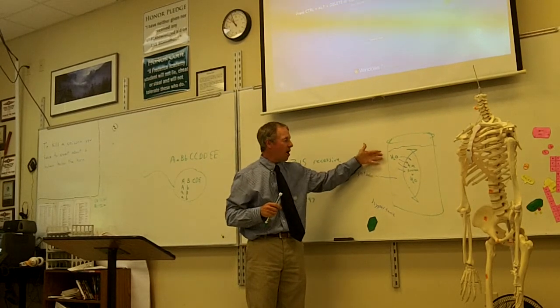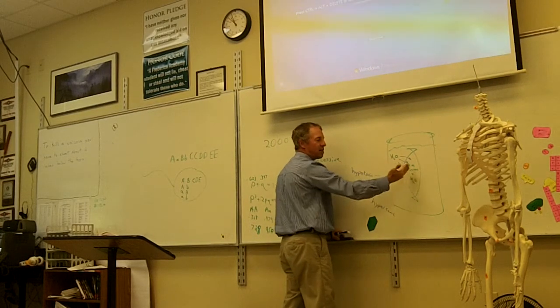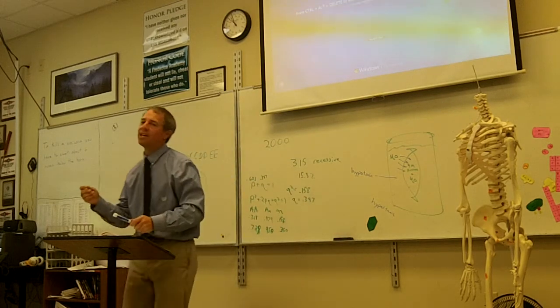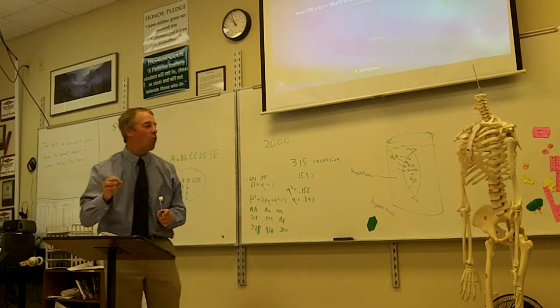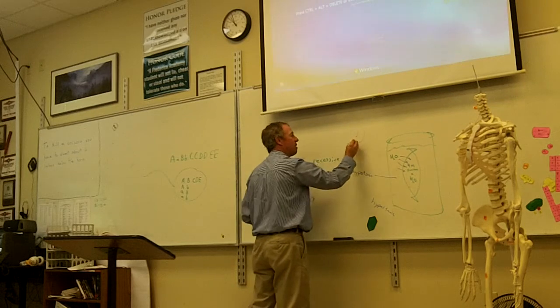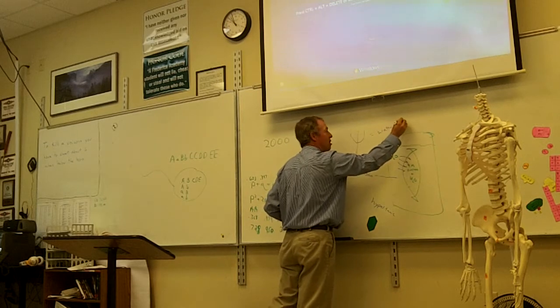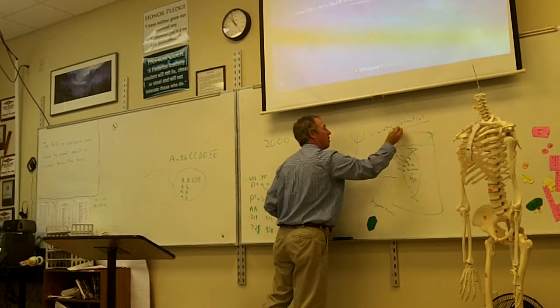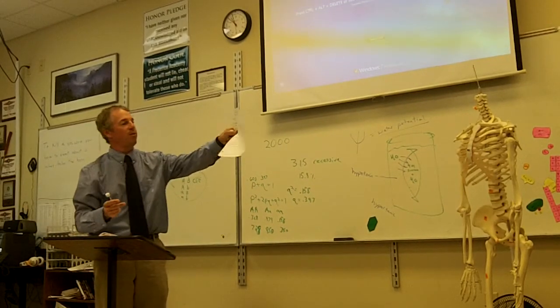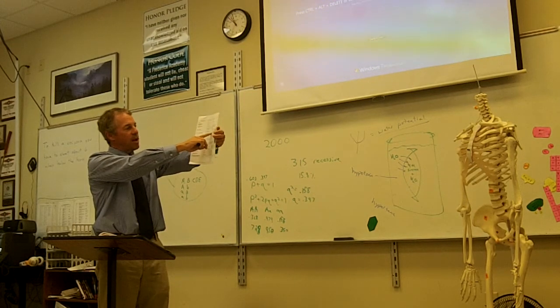Okay, so the water will go into this bag. What will we say if inside the bag and outside the bag were exactly the same? Isotonic. And if we were going to give a water potential number, do you remember the little psi sign? That's water potential. You can figure out the water potential by using a formula, and they give you the formula on the page. It's right there on the right side on the back of this page.